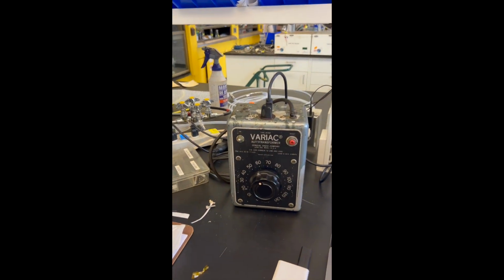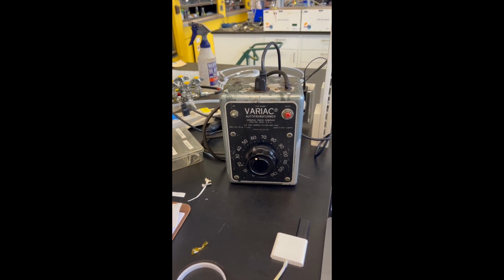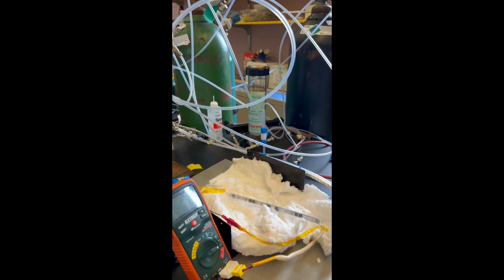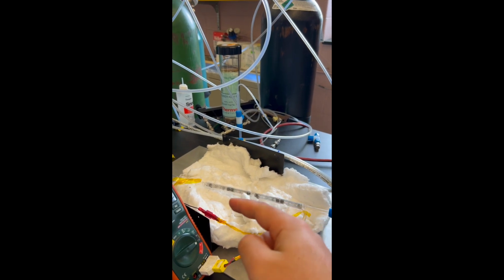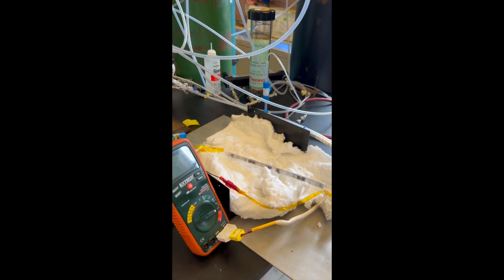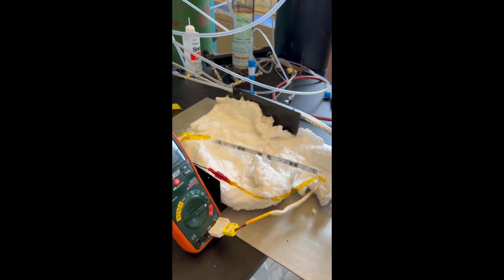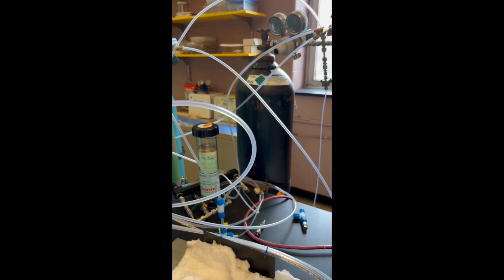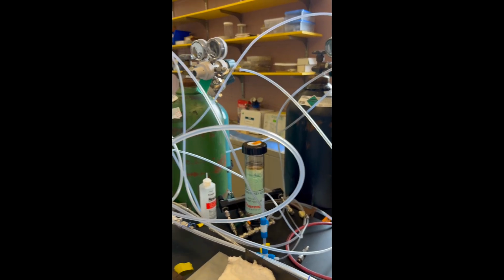So here we have a voltage controller, which is controlling the voltage to a heating element around the thermal desorption tube. So here is the heating element put around this tube, which we're calling the thermal desorption tube. And this thermal desorption tube carries the nitrogen carrier gas and heats it up. Here is the source of the nitrogen carrier gas. This is a cylinder of nitrogen.